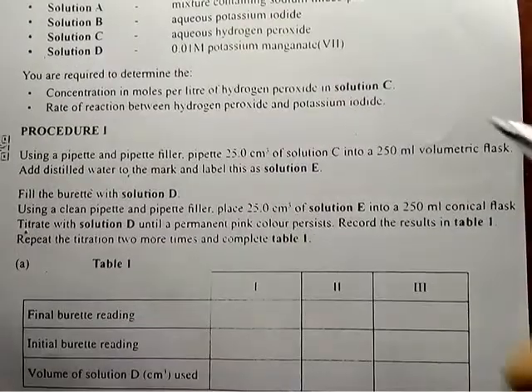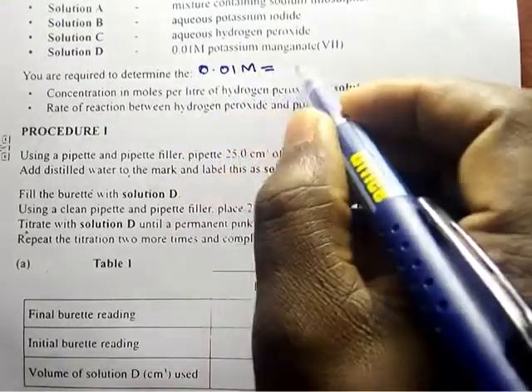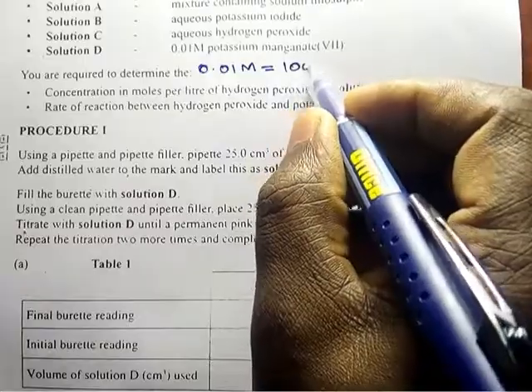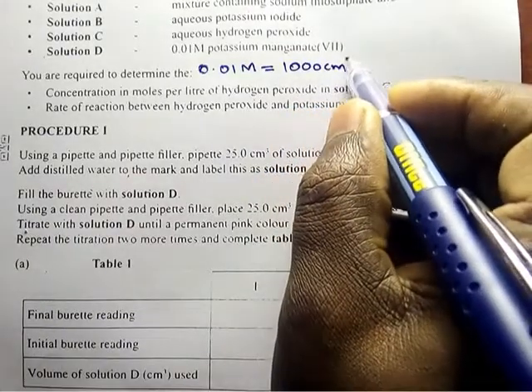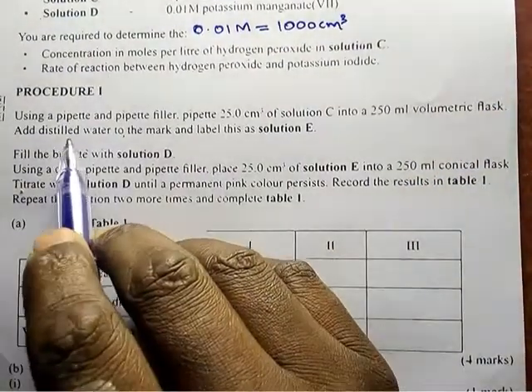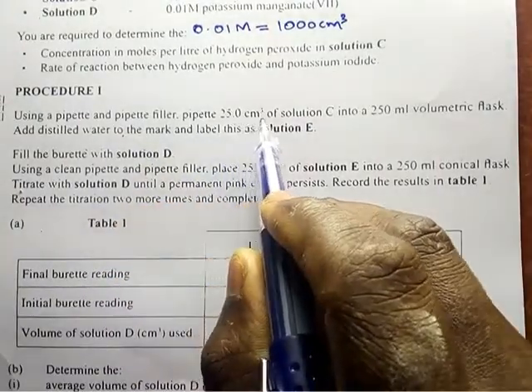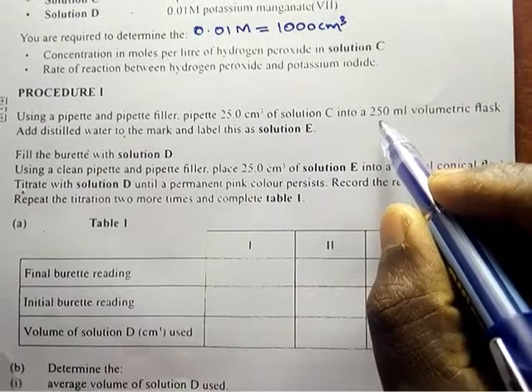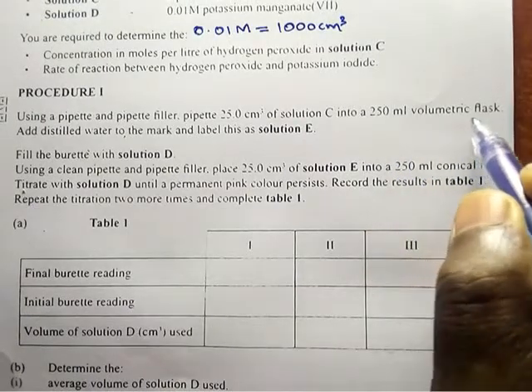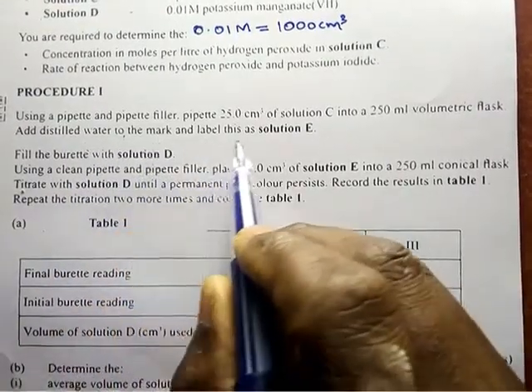First, before we go to procedure 1, whenever you see, for example, 0.01 capital M, this means the number of moles in 1,000 centimeters cube of that solution. That's what it means. Using a pipette and a pipette filler, pipette 25 centimeters cube of solution C into a 250 ml volumetric flask. Add distilled water to the mark and label the solution E.